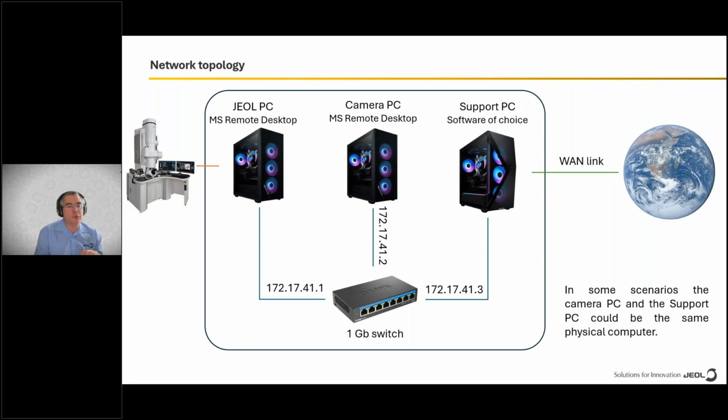This computer communicates with the JEOL PC, the JEOL computer that is provided with the microscope. For many of you, the only experience of using a computer with a TEM is just this JEOL PC.